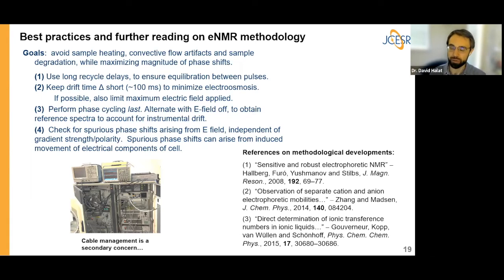And for sure, because the time scale of this diffusion or drift time is so long relative to all the processes that can occur, we're just going to be averaging across all the different speciations that might exist in the electrolyte. And that's something that I'll get into a little bit more in the last part of this talk, where I discuss how the simulation work can inform what the solvation structures are. And just to finish up on that, the apparent diffusion, the amount of decay, is going to be larger than if you just did a PFG experiment that just measures the diffusion.